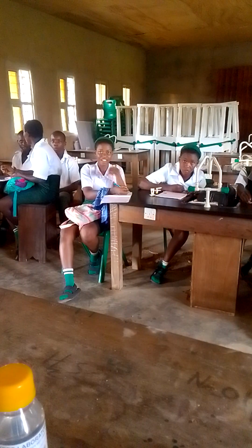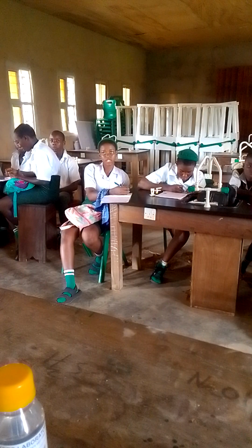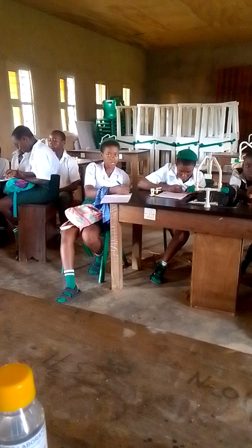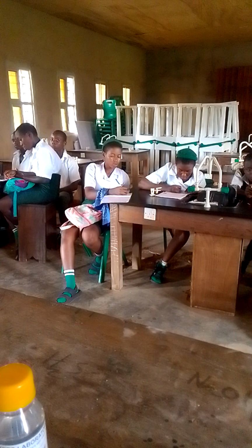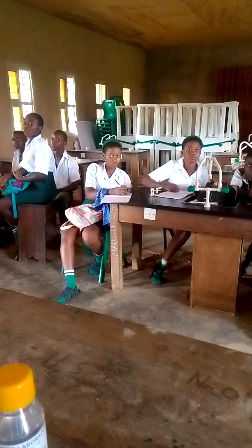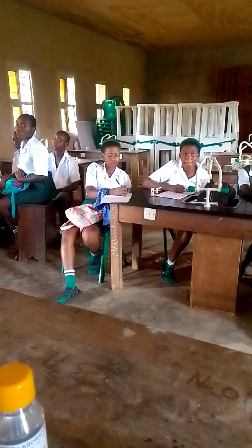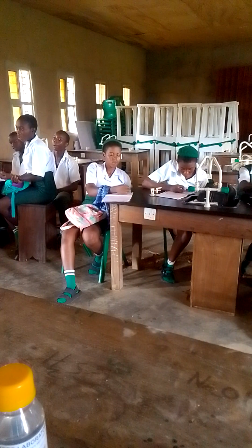Hello, we are back to today's practical. Now, in today's practical, we are going to look at qualitative analysis: test on unknown inorganic compound.